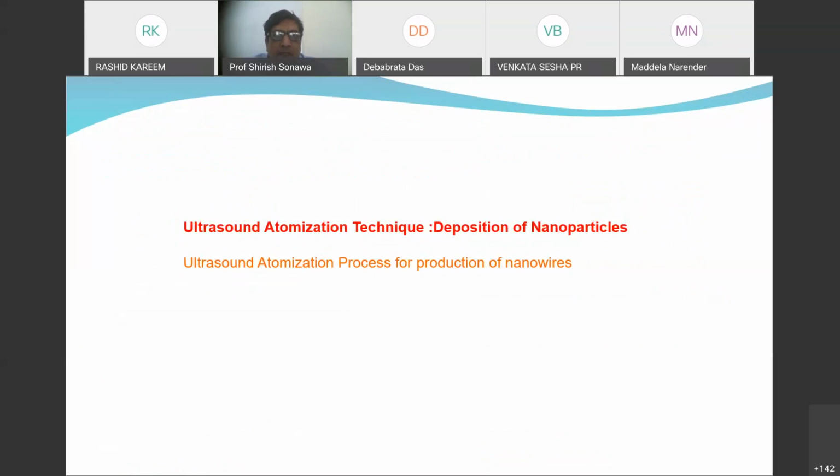Okay, atomization, the meaning of atomization is the droplets.